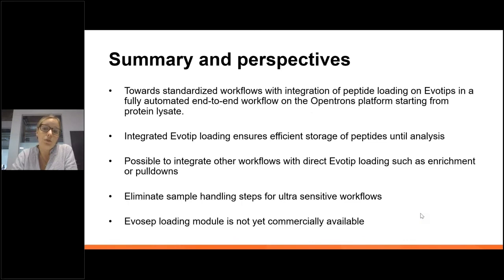So it's possible to integrate other workflows with the direct Evosep loading, such as enrichments or pull-down strategies. And I have to say that the loading module is not yet commercially available, but we are super excited about it, and we are working to get it finished.